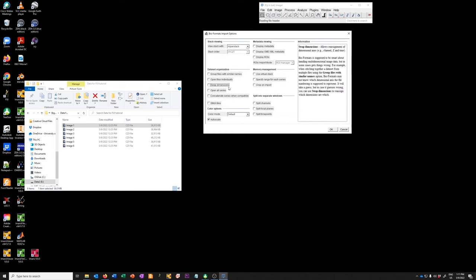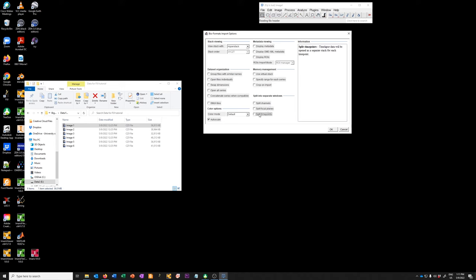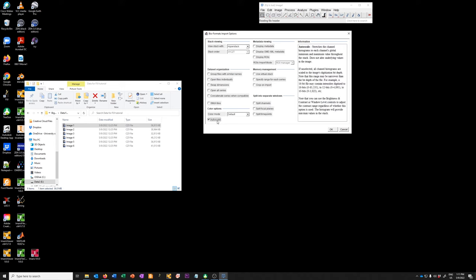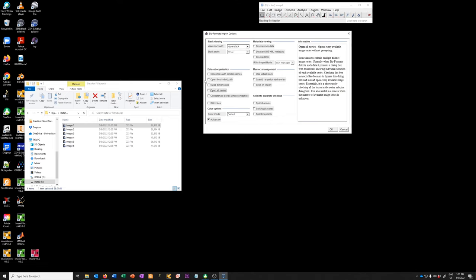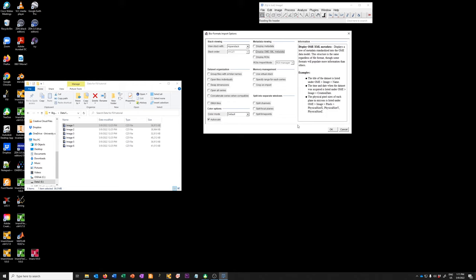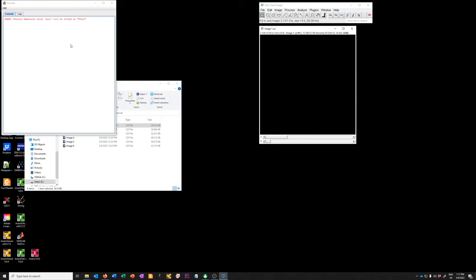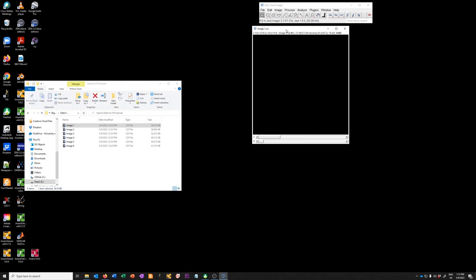You might want to open and immediately split channels if it's a multi-channel image. The only thing checked right now is the 'auto scale' option, which fiddles with the display settings to try to make the image immediately visible. Hovering over options shows an explanation on the right. It may seem like you have to make a lot of decisions right away, but it actually illustrates the flexibility of this software. Click OK to open.